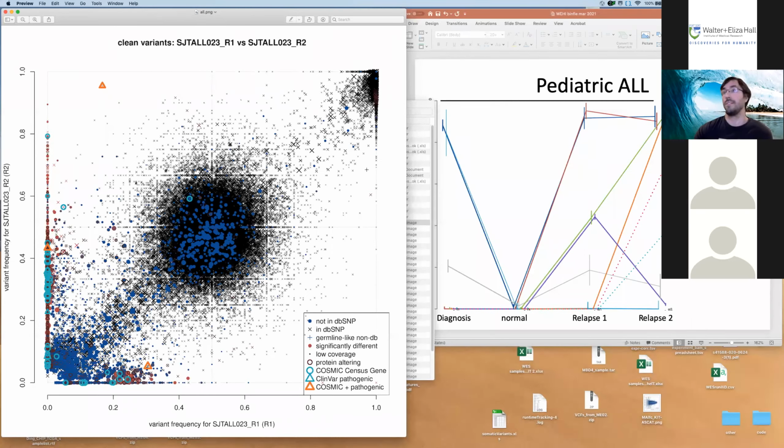So this is the contaminating germline, right? This is the donor that doesn't have a variant in that location. That's why it's bleeding down here. So you will see a similar effect down here as well. And actually, if you look at the last clone here, the cyan one, that one might have a bit of donor germline variants in it.